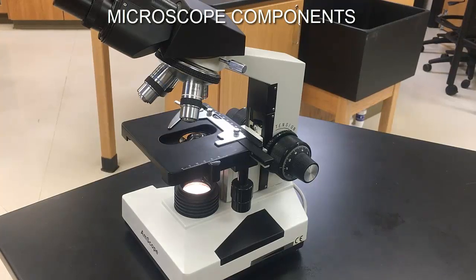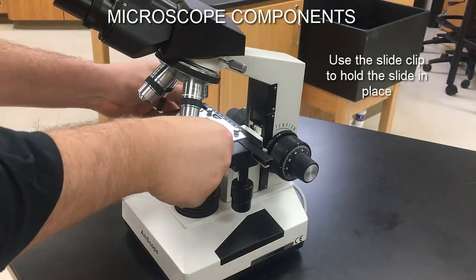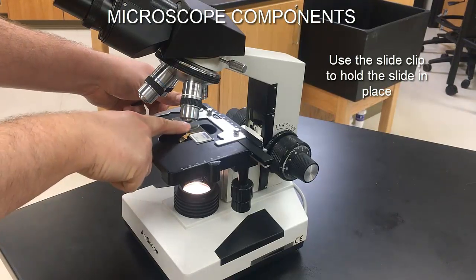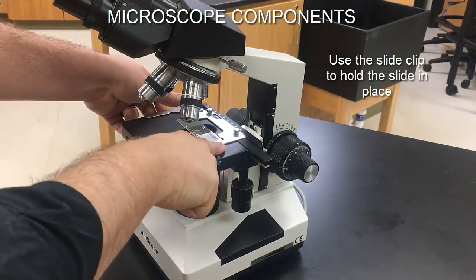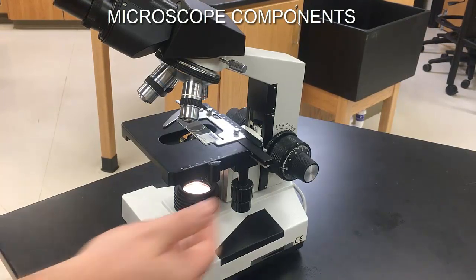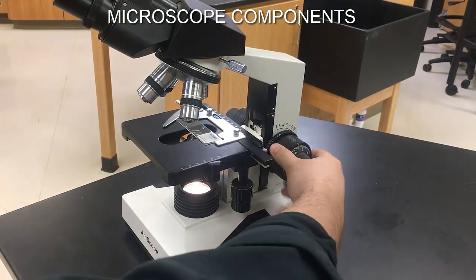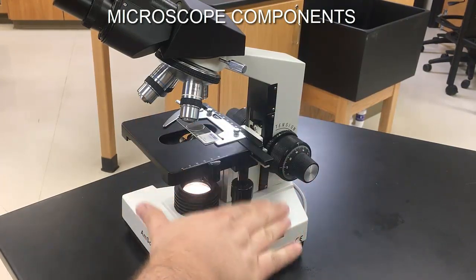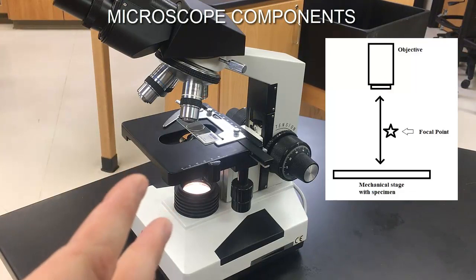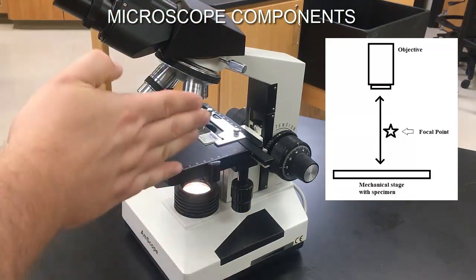To demonstrate, I have a slide here. The slide is placed on top of the stage, which has a stage clip. Pull the clip back, let the slide slip in, push it flush against the far side, and release the clip to hold the slide in place. Now we need to bring the stage up or down — the specimen will come into focus somewhere between the very bottom and a point above it called the focal point, where the image comes into focus in the magnification pathway.